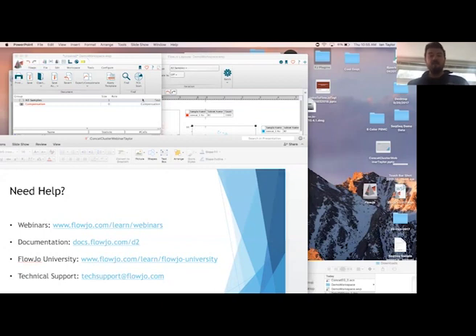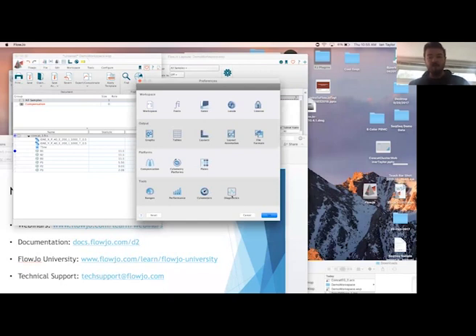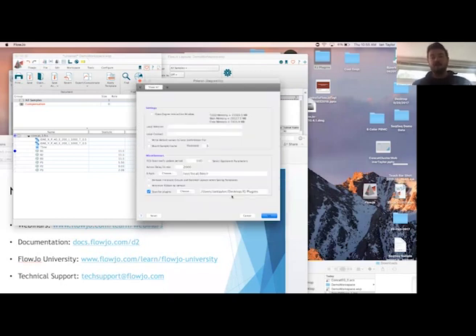Once you have downloaded those plugins, if they are R-based, I'll just show you. If you open up the preferences in diagnostics, there's actually a section here, scan for plugins. In the case of this Mac, I have the plugins on my desktop. On Windows, this will be slightly different. But the R path here has to point to, in the case of the Windows system, the executable for R. That'll be in the R bin and then the bitness of your machine, so either x64 or x86, I believe, if you're on 32-bit. That's a tough question.